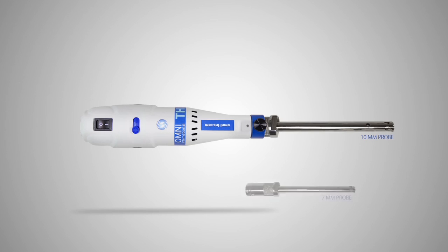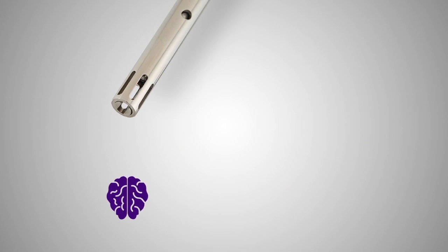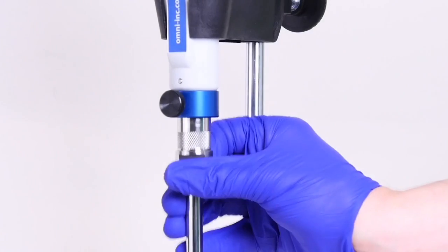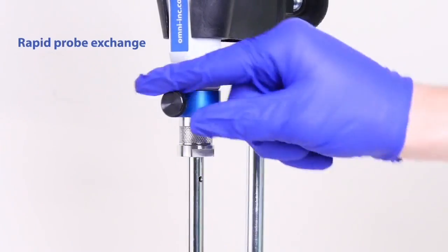A wide array of Omni Generator probes are available. Choose from flat bottom for soft tissues and emulsions, or sawtooth configurations for tougher tissue samples. Omni Generator probes feature quick connect couplings to ensure rapid probe exchange.